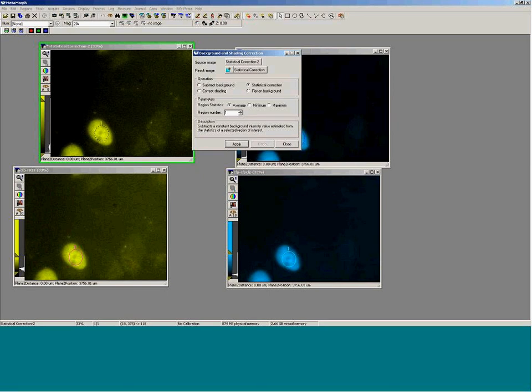So you'll need to do the research within the papers to figure out the best technique or method in order to do FRET efficiency. Some will take the corrected image and divide by either the acceptor image, this one, or by the donor image, this one. So it really depends on what method you want to use in order to do that FRET efficiency calculation.